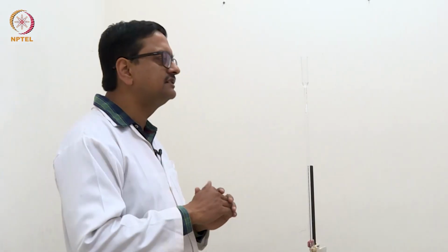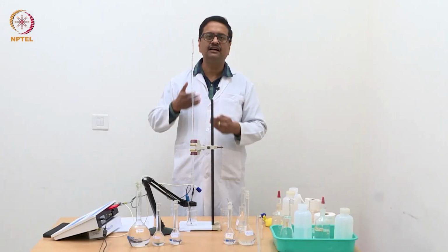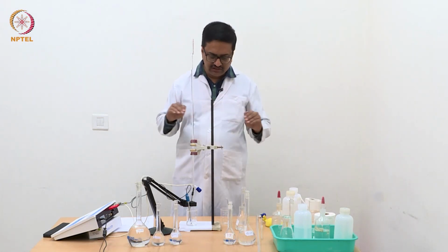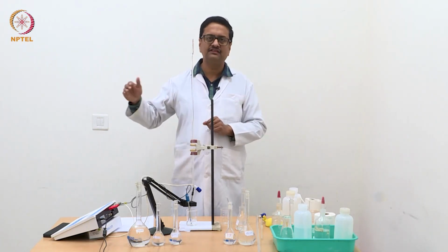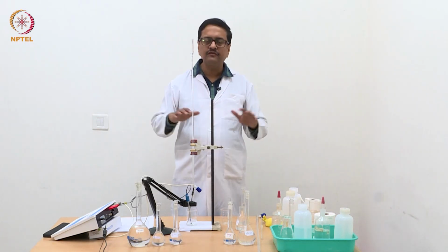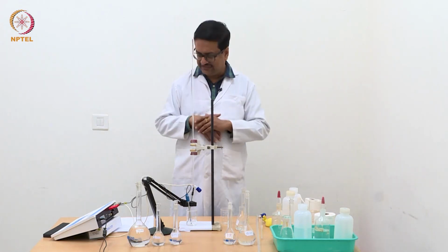In this titration, chloride ions will be continuously removed and replaced by nitrate ions, which have about the same conductivity. Therefore, as long as there is chloride left, there will not be much change in conductance; it will remain almost the same.